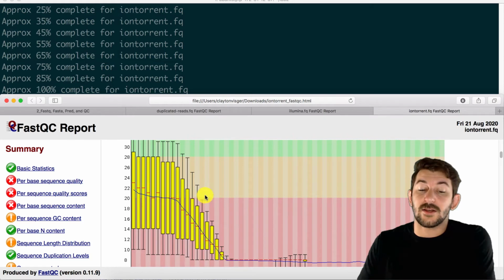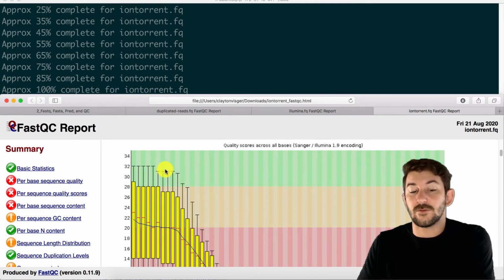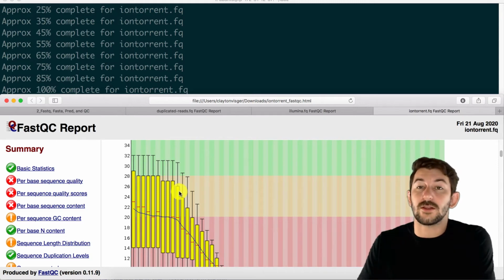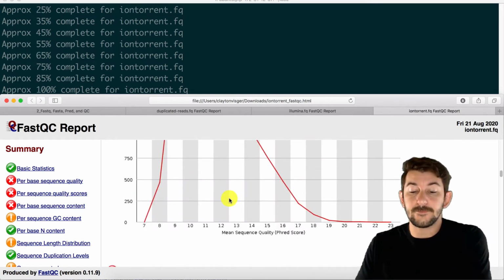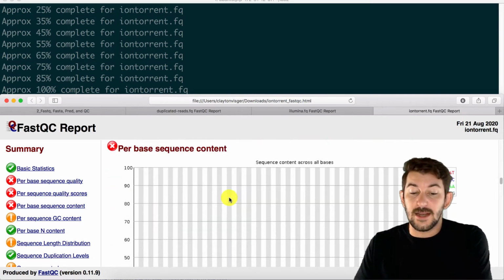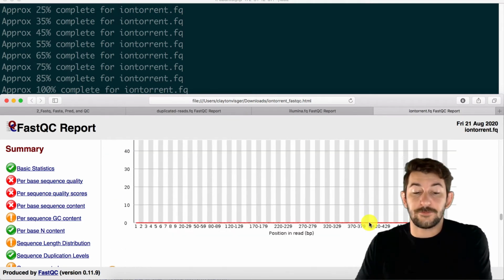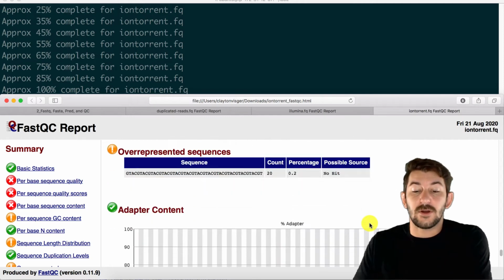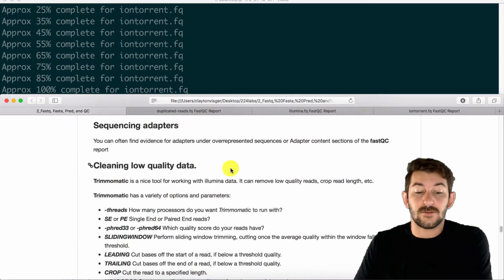But in general, the quality of these looks quite low. It's really only the top 75th percentile of any given read's base pair position that is above that 30 quality score that we're looking for. So I would imagine if we quality controlled this, we'd lose a huge chunk of our sequence data. So you can scroll through here as well, and you can see some of the noise that gets associated the further you sequence out. Okay, so that's just looking very quickly at those data sets. And so next, we're going to talk about how to trim those data.